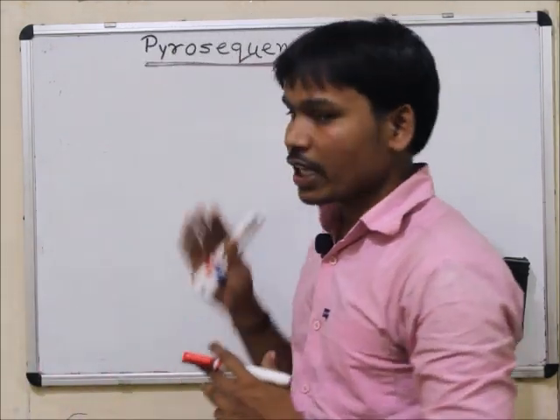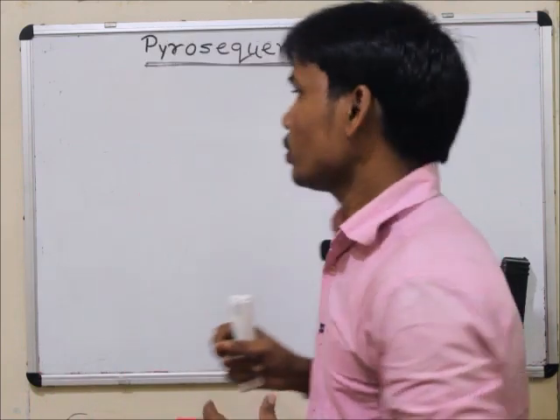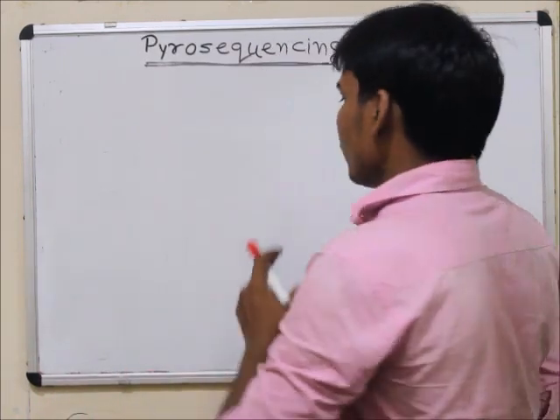Before this lecture, I have described the Maxam-Gilbert method of DNA sequencing and also the Sanger method of DNA sequencing. So now I will describe the pyrosequencing method.